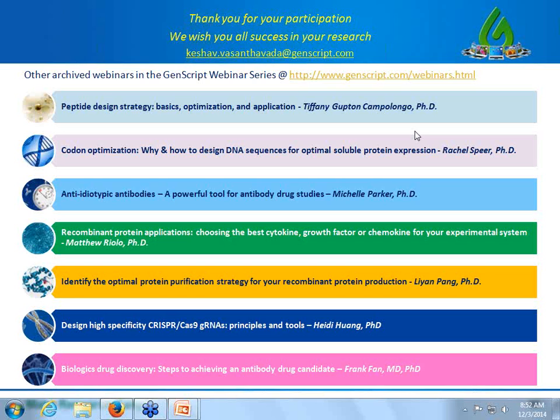But if you look at your sequence, what I would recommend is look at literature references. If there is a precedent, if somebody has tried this in insect expression system and it worked, and if somebody says that E. coli we have tried, it hasn't worked, mammalian hasn't worked, insect works, or maybe yeast works. So one way is to go about figuring out from publicly available sources. If it's a novel protein, novel gene, right, there is no literature precedent, this has to be done empirically.